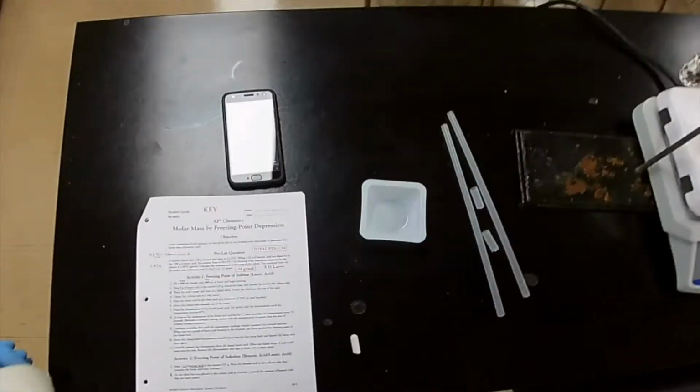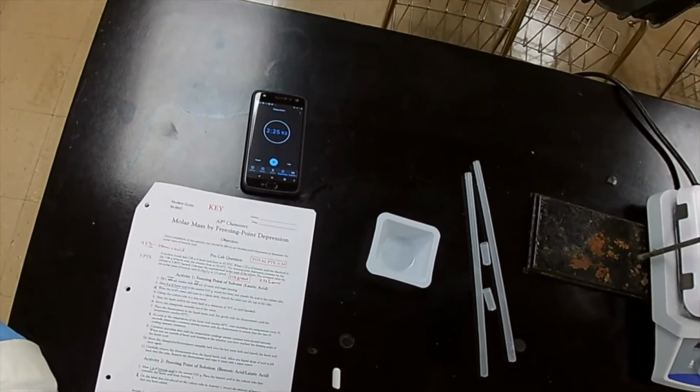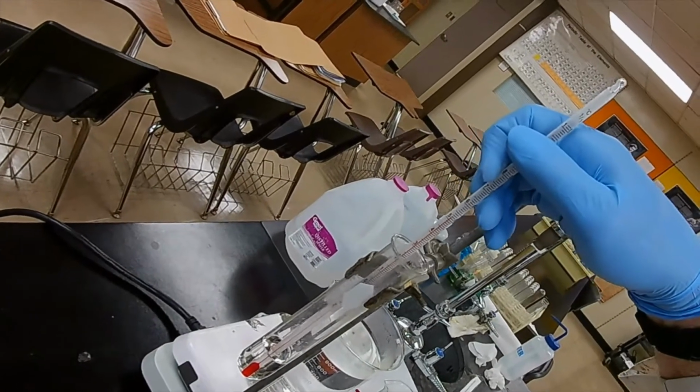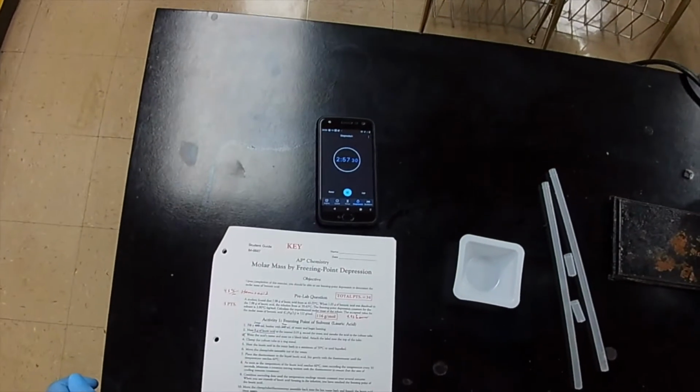I think the reason it's not cooling as fast as in past experiments is there's just one of me, and I can't be stirring and writing at the same time. Here we go now. 51.5. Coming up on 3 minutes. 180 seconds. Here we go now. 49.5.